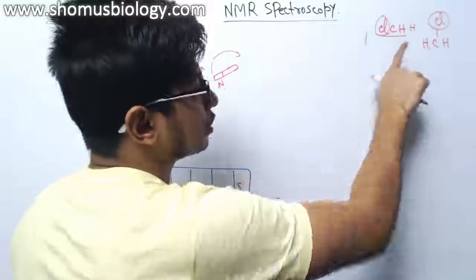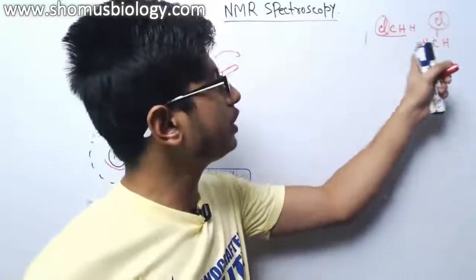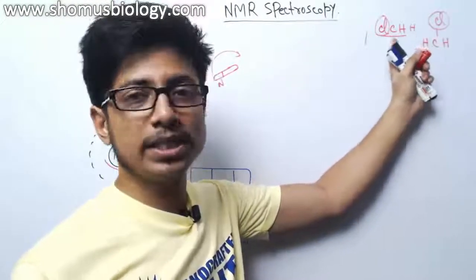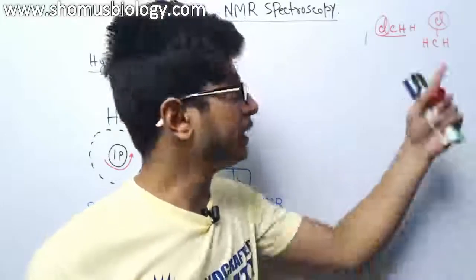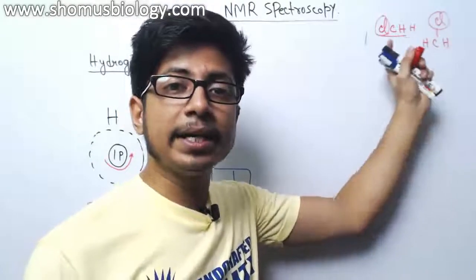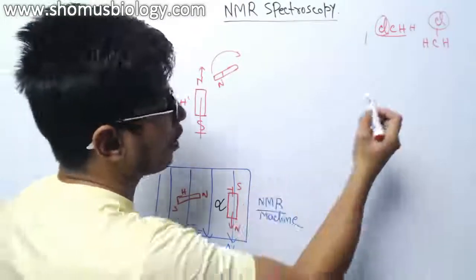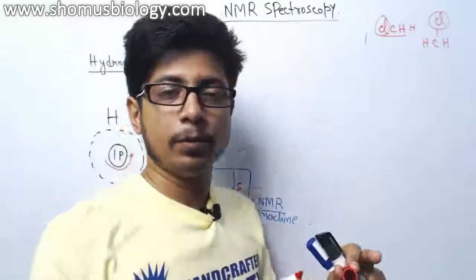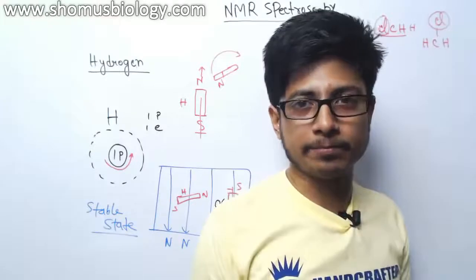Normally IR spectroscopy or mass spec are not very good at distinguishing between these two molecules, because they have the same number of carbon, the same number of chlorine, the same number of hydrogen. So they might end up telling us these two molecules are the same, but they can be different, and this difference can be identified only with NMR, because NMR can give you an idea about how the atoms are placed with respect to their positions and attachment with the nearby atoms.